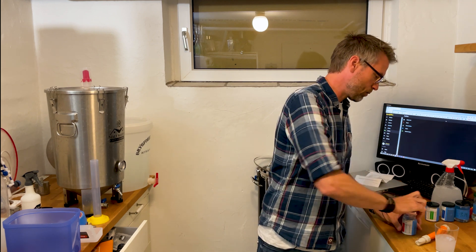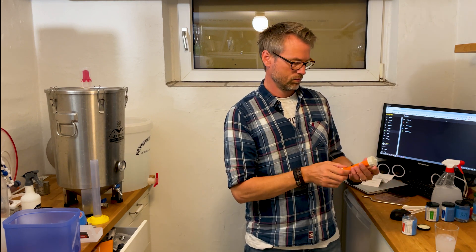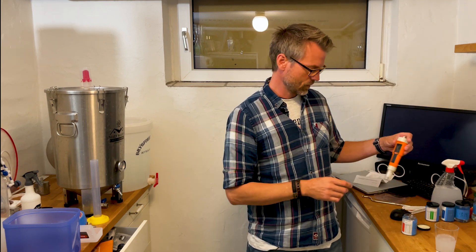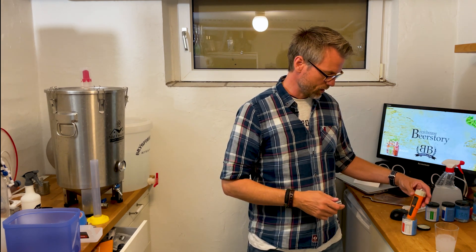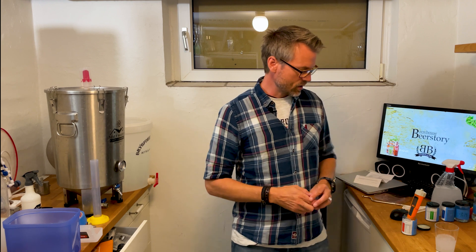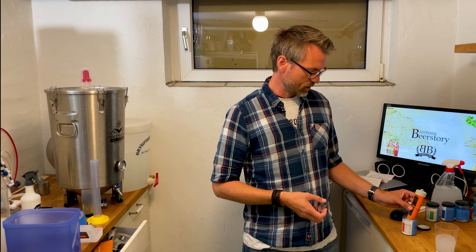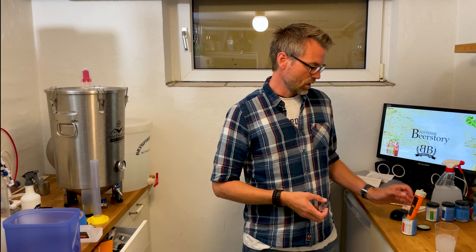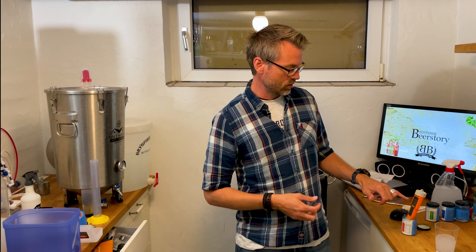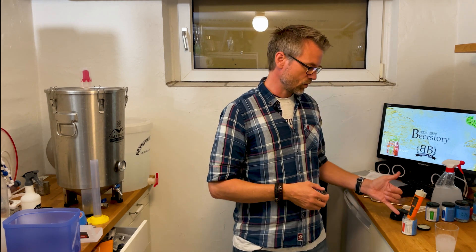When I have to calibrate, all I do is turn on the pH meter, remove the cap, put it in the solution, stir just a little bit, and let it rest until it's stable. When it's stable I press the calibrate button for three seconds. It will show the actual value that it measured and recognize the pH value of the solution.